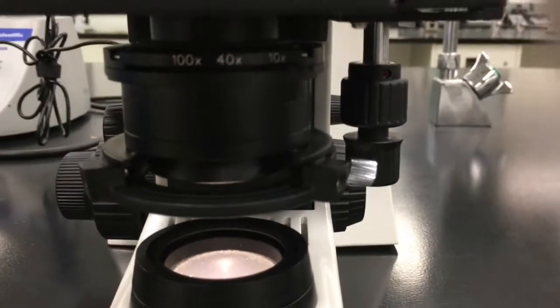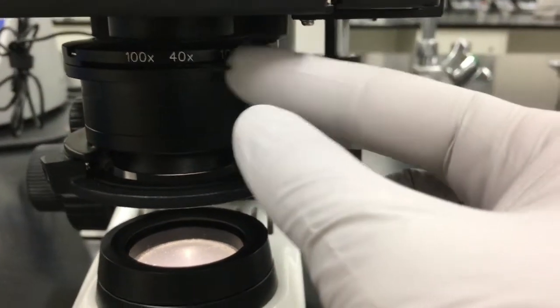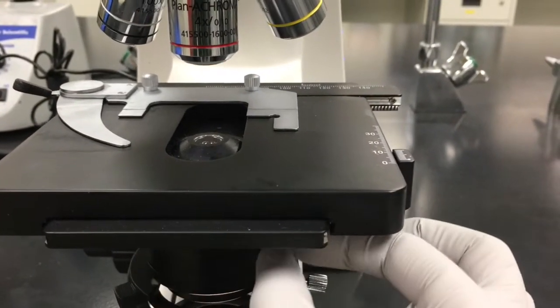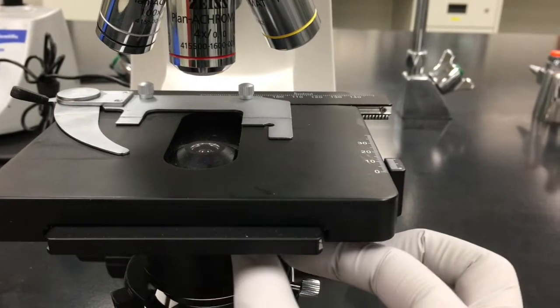Above the light, you'll find that there is a condenser. This restricts the diameter of the light beam that is shown to the objective lenses. So start low with the lower power objectives and increase as you increase magnification.